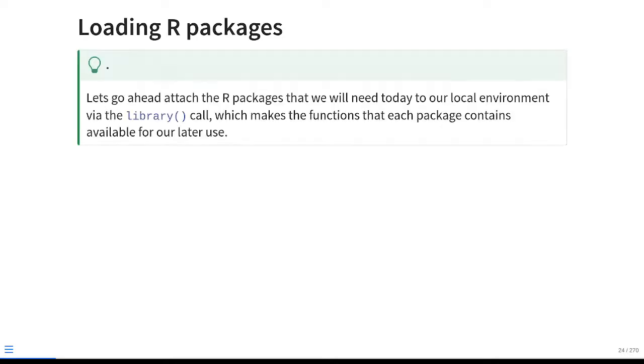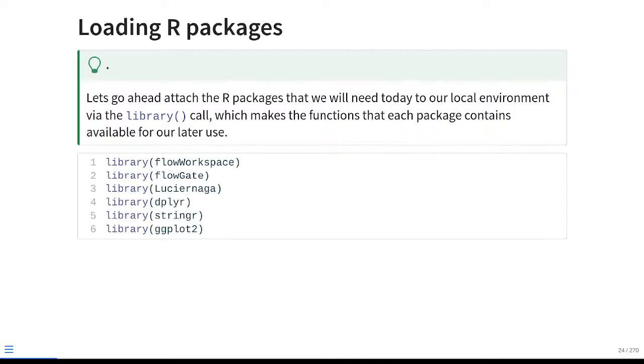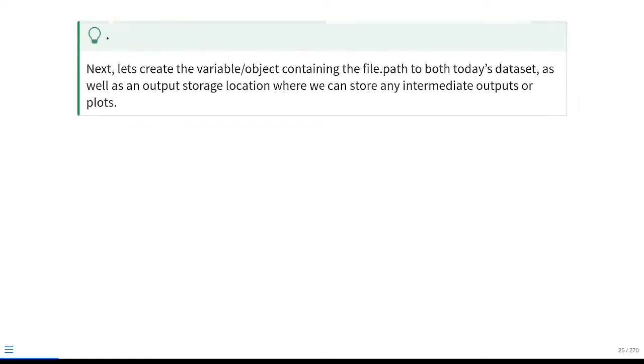As always, we need to attach the R packages that we'll need for today, and this can be done by using the library function to attach them to our local environment, which will make all the functions available within those packages usable when we need them later. For now, we're using a bunch of the Cytoverse packages as well as a bunch of the tidyverse packages in general.